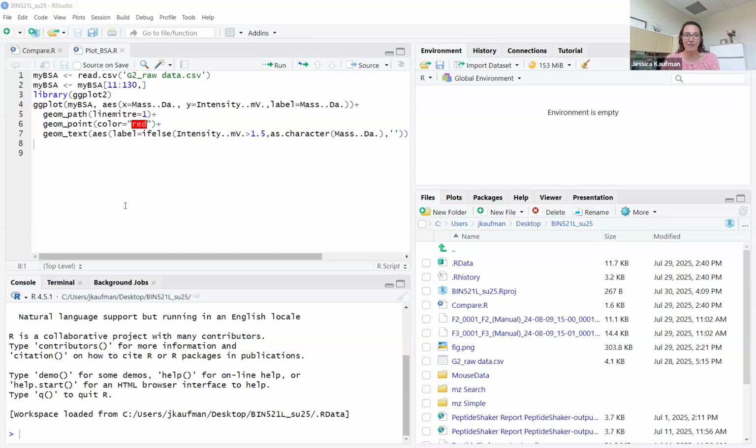So the first thing that you have to make a figure of is the bovine serum albumin peaks for the non-digested protein. Here we expect to see about 3 peaks, and they're not quite in the perfect spots. They're not exactly where they need to be because our calibration file was not high quality. I went back the week after lab and reran some of the spots. And I think the real issue is the actual peptides in the TOF mix were pretty degraded. And so we didn't have a good quality sample for our time of flight mix, which meant that our peaks weren't where they were supposed to be for calibration.